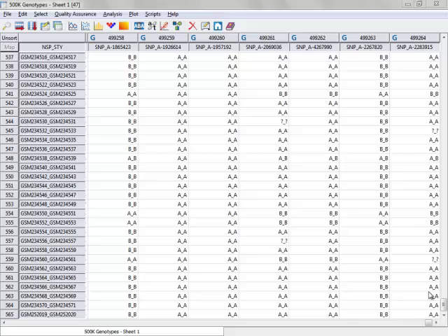and roughly 500,000 SNPs designated by the columns here up on top. So the first thing we want to do is apply a genetic marker map to this spreadsheet. The reason is that we'll ensure that the markers are placed in the correct order according to chromosome and genomic position, as well as apply some annotations from the Affymetrix annotation file to the SNPs so you can glean more information from the most significant SNPs.